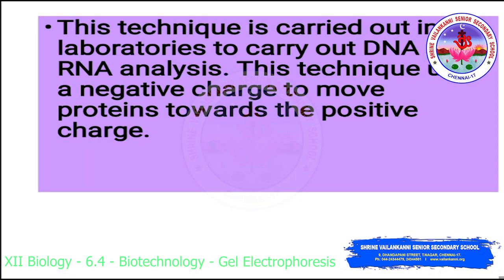This technique is carried out in laboratories to carry out DNA and RNA analysis. This technique uses a negative charge to move protein towards the positive charge. So one type of electrophoresis is gel electrophoresis, where the technique is implemented in laboratories to carry out DNA and RNA analysis.